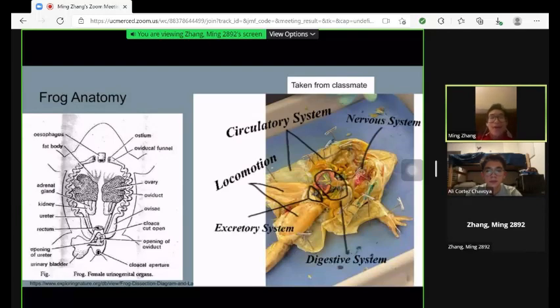Next is the digestive system. Here, the frog's intestines and stomach can be seen clearly. Not too far off from the rat in any case. They do feed on similar animals too, so it could be why. Next to the stomach, you can see the kidneys, which are part of the excretory system.